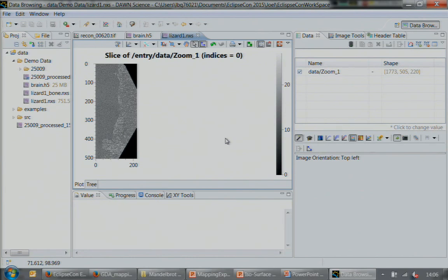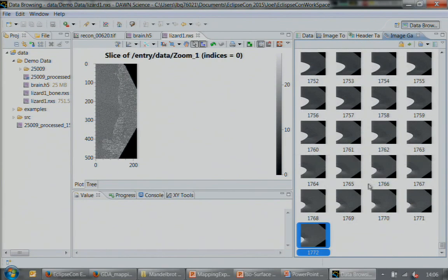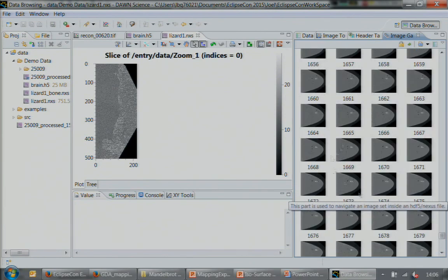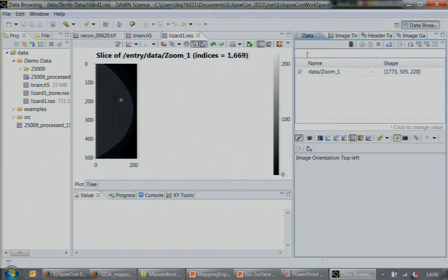Sorry, guys. OK, so here we have a simple X-ray CT scan of a fossilized lizard within a rock, but for some reason it's not coming up, I'll just show you the other version. Essentially, as you can see here, it is a couple thousand images of this rock, and if you look here, you can see there's a slight bright spot, which actually relates to the lizard skeleton.